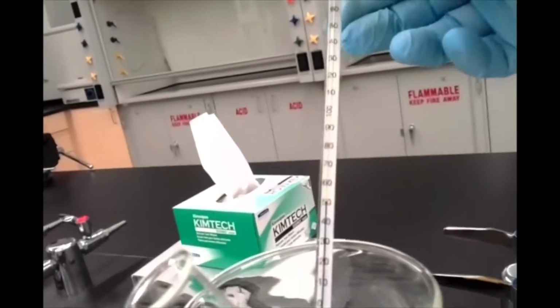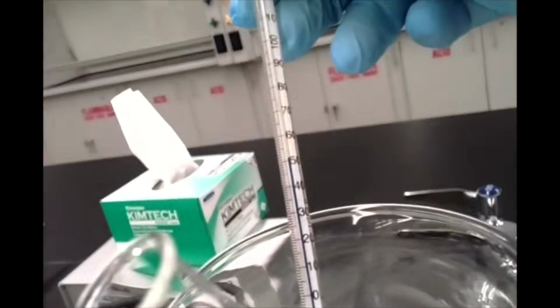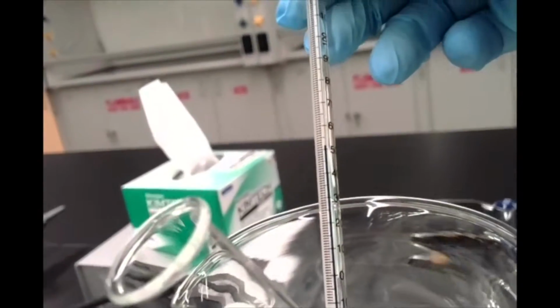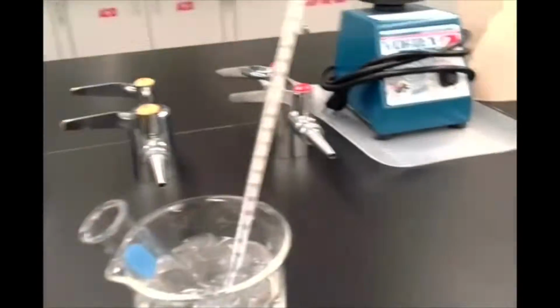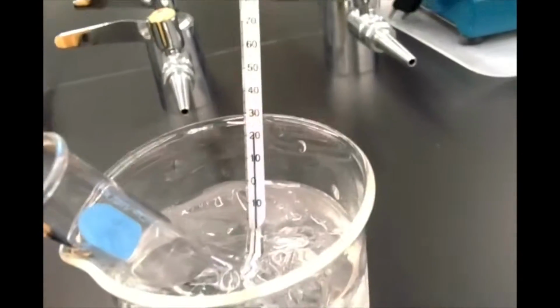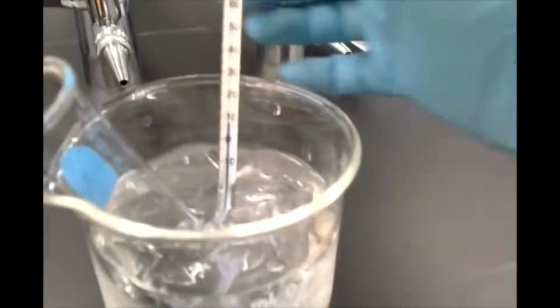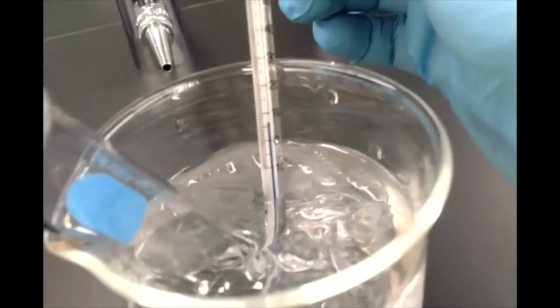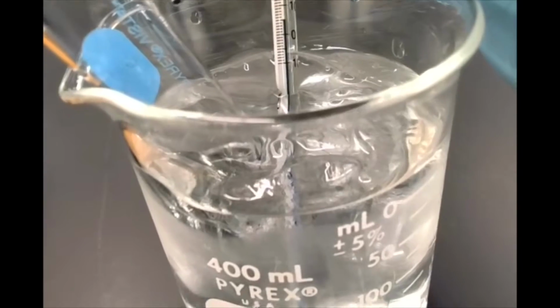All right, so if we look at our thermometer here, we can see that we are at a temperature. It might be a little hard to see here with this webcam, but I would say we're about 52 degrees Celsius, probably climbing a little bit by the time we get this test tube taken out. But we'll let this ice bath here also cool down. We can see what temperature that's going to be at. All right, now it seems to be cooling down to about, might be a little hard to see there, but right now it's about 6 degrees Celsius.